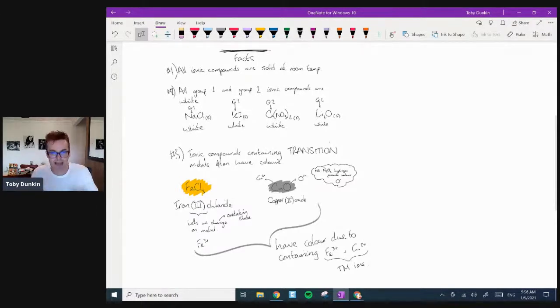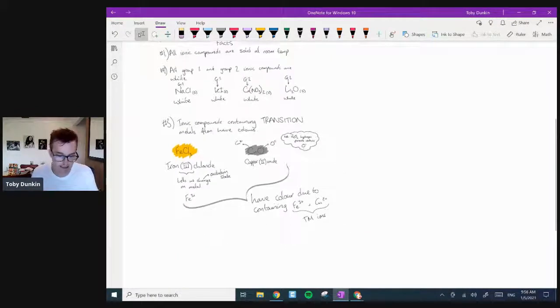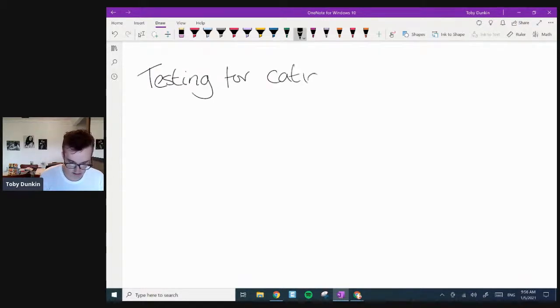We do chemical tests. And actually, the first chemical test that we tend to do is what's called a flame test. And this tests for cations. So, subtitle, please, folks: testing for cations.